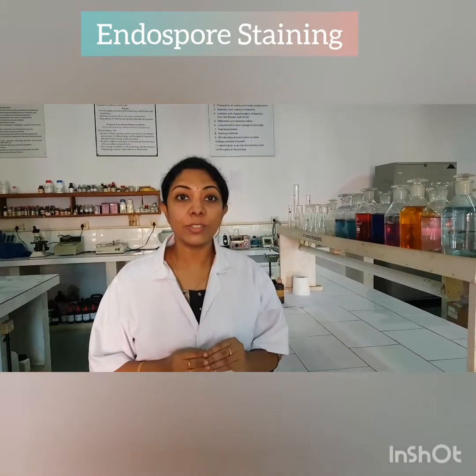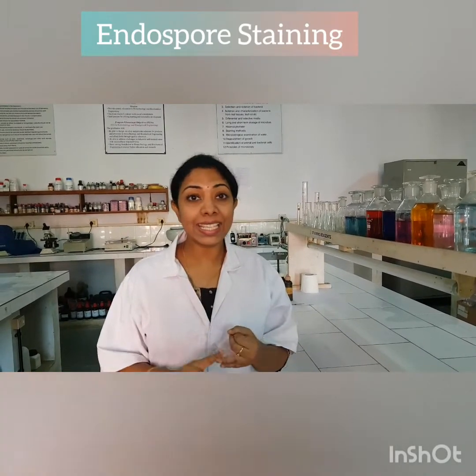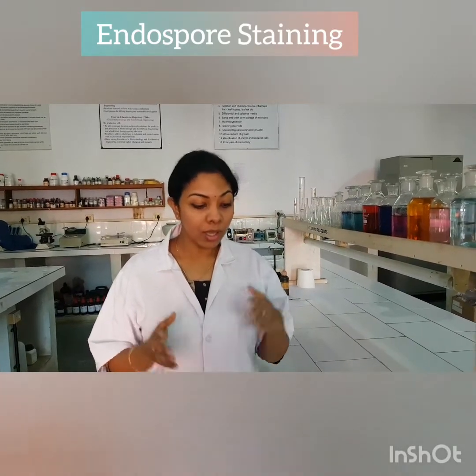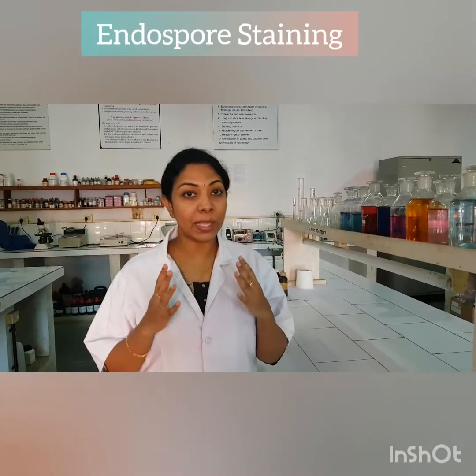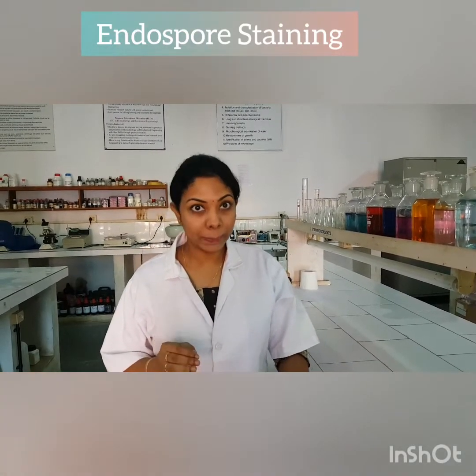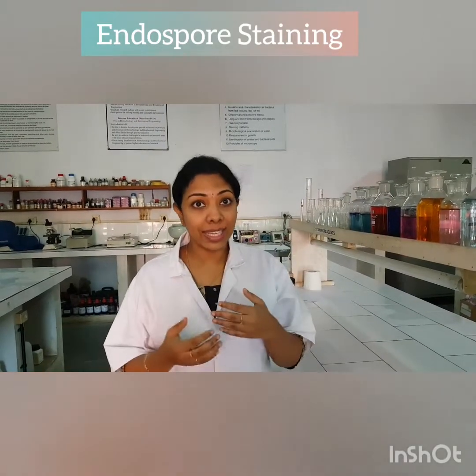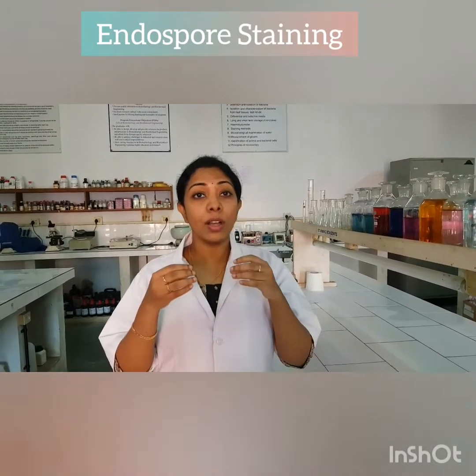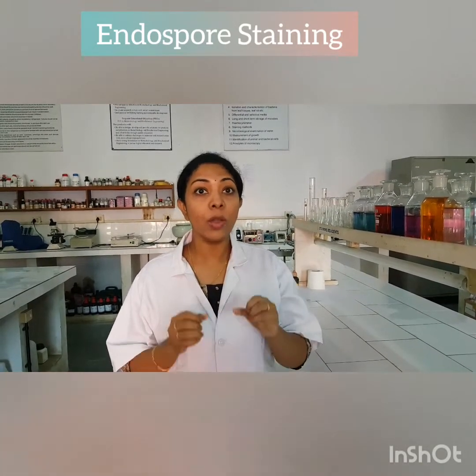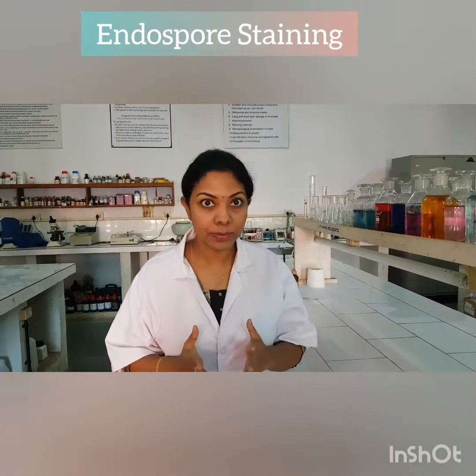Endospore staining is a differential staining technique which is used to identify, detect and differentiate vegetative cells and endospores. Here we use Schaefer-Fulton's method of staining endospores, where the primary stain used is malachite green. Because the endospore resists the stain, we have to force the malachite green into the endospore with the process of heating. So here the heating process acts as a mordant.